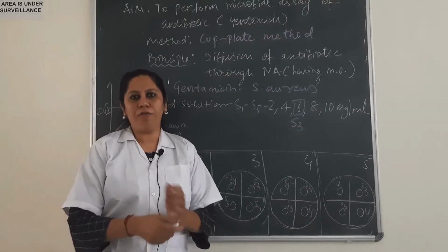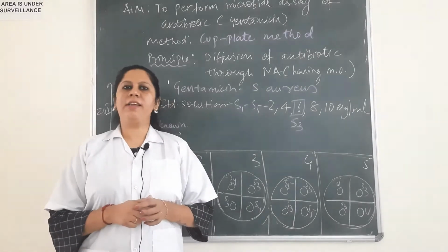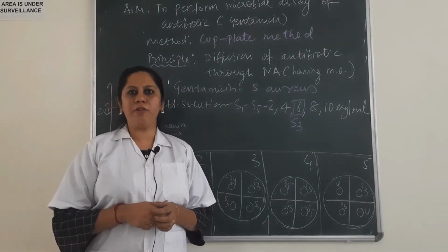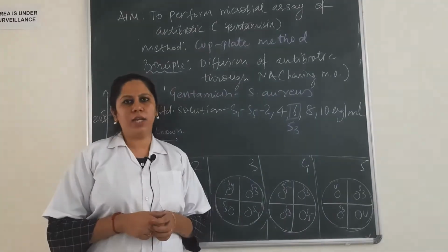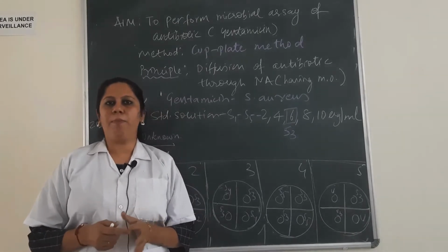Online sessions of Pharmaceutical Microbiology. Myself, Ms. Tosha Pandya, and my colleague Ms. Kaushika Patel of the Department of Pharmaceutical Technology will be demonstrating the practical tutorial of microbial assay of antibiotic. In this practical, we will see the microbial assay of antibiotic by cup plate method.